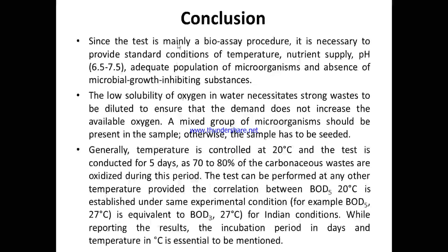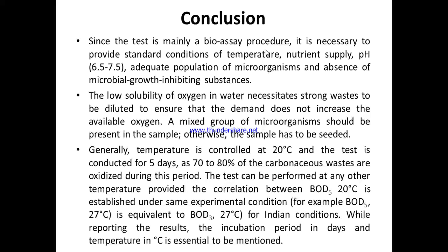Since the test is mainly a bioassay, I have told you students the environmental significance: we determine BOD so that we can judge whether the water sample is polluted or non-polluted. If the BOD value is high, that means polluted. If the BOD value is low, that means it is non-polluted, or rather treated.